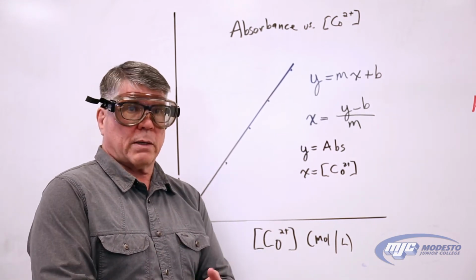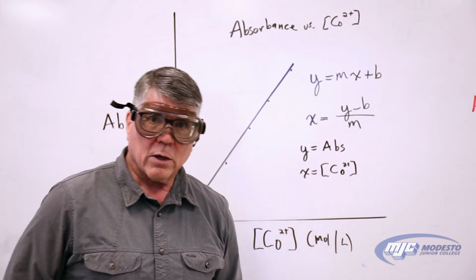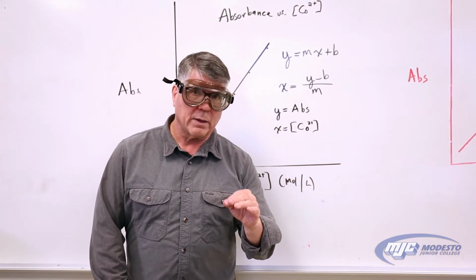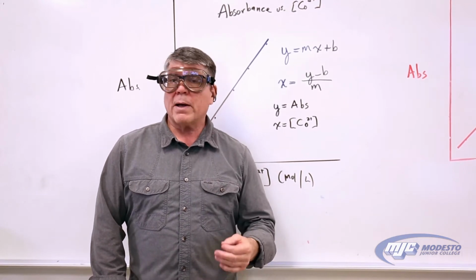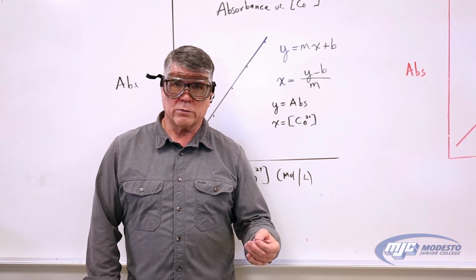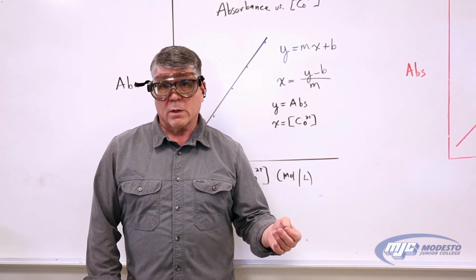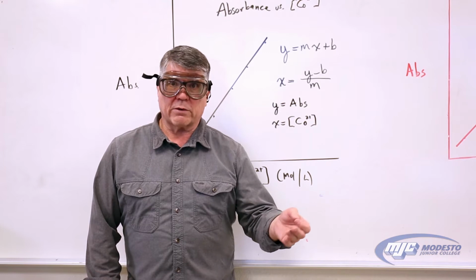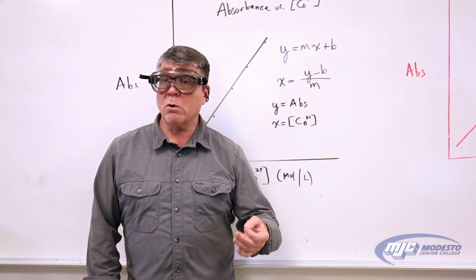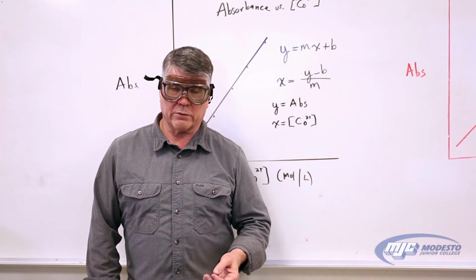To make our standard curve, we're going to need a stock solution. You should calculate ahead of time and place in your pre-lab about how many grams of cobalt-2 chloride hexahydrate you'll need to make 50.00 milliliters of a roughly 0.30 molar solution of the cobalt-2 chloride hexahydrate.